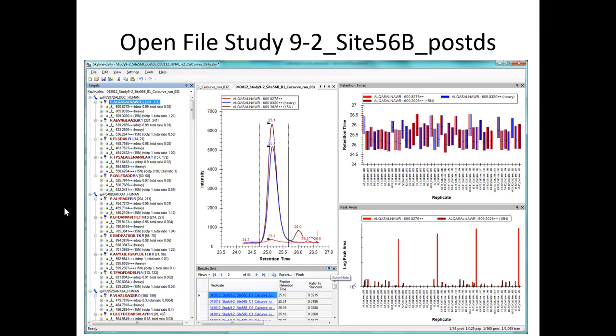So I would like you to click on that first peptide, the ALQA, and then you should see a really similar peak profile as this, where the red is the light signal, the blue is the heavy peptide internal standard, and the brown is the peptide coming from the N15 protein that was spiked in.